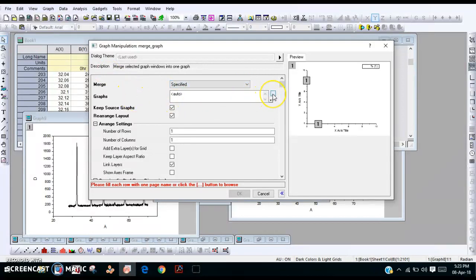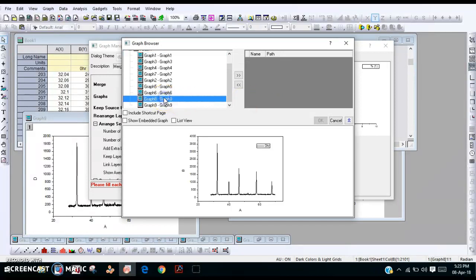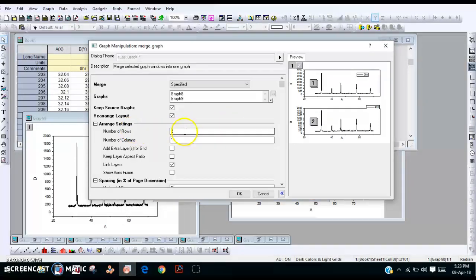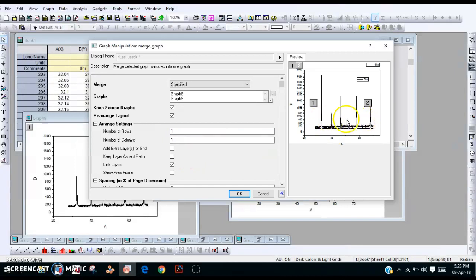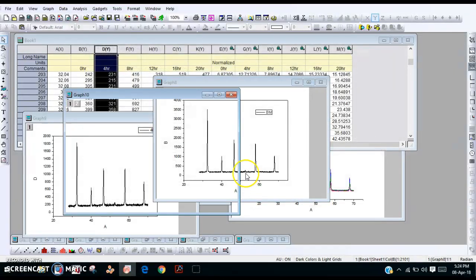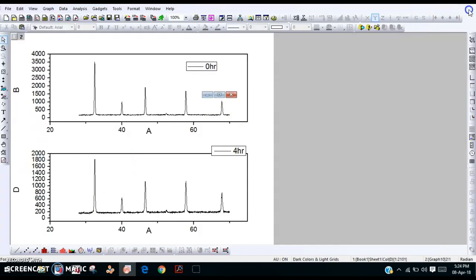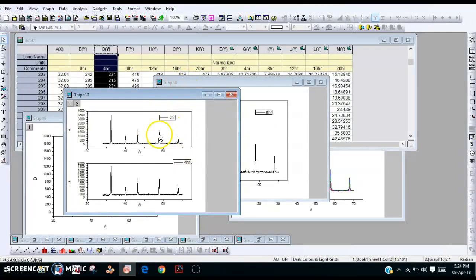Select the curves from the list — select graph 8 and put it on the right side, then graph 9 also on the right side, then click OK. Set the number of rows to 2 and columns to 1. If you want them overlapped, set columns to 1; if you want 2 columns side by side, select 2 columns and click OK. A new image is created, and you can change all the parameters as desired. Similarly, this image can be merged with another image plotted earlier.